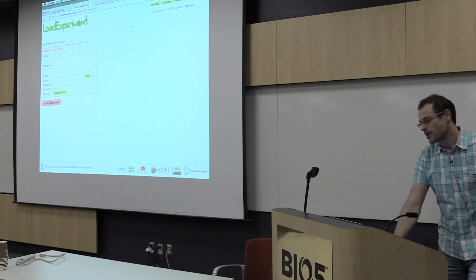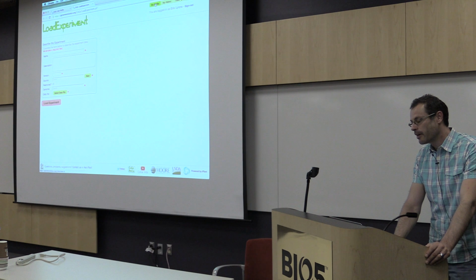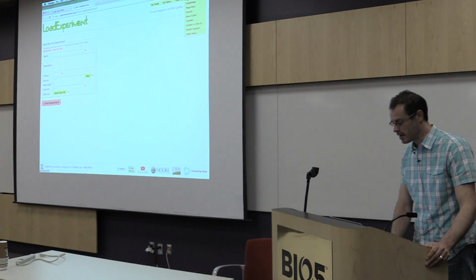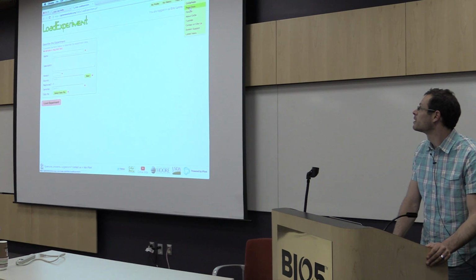So once you're in load experiment, if you notice at the top right, we have the exact same menu as you saw before. One of them is called help. And so if you ever play with CoGe, help is a good place to go find some help. But click on the link called Page Docs.